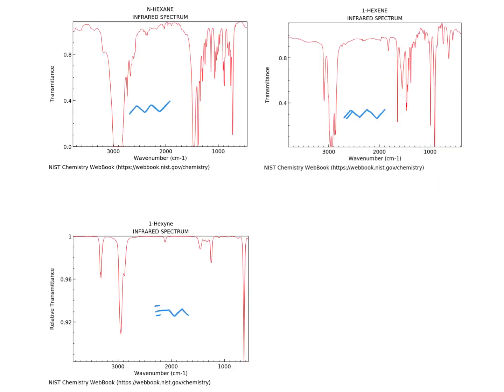Okay, the other thing that we can see here, and keep in mind there's lots of functional groups, so these are just examples of what those functional groups are. The other thing I forgot to say earlier that I should note, anything that's above 1500 we're looking at. Anything below 1500 is considered the fingerprint region. So like right here, we don't really look at that too much unless that's what your specialty is. If that's the case, then great, but we're not really going to look at that in more detail.